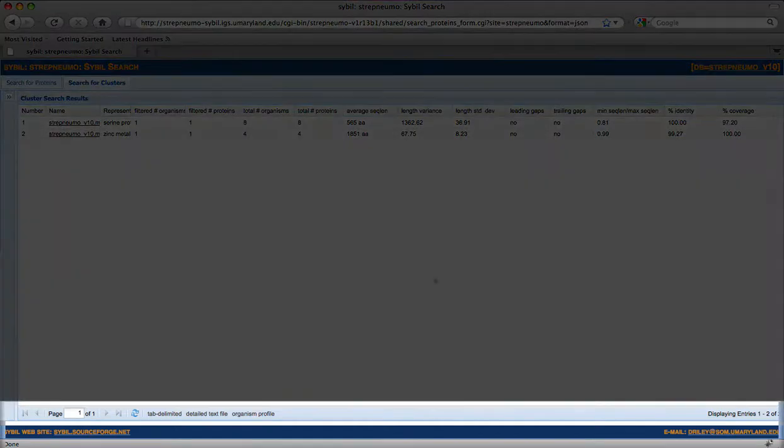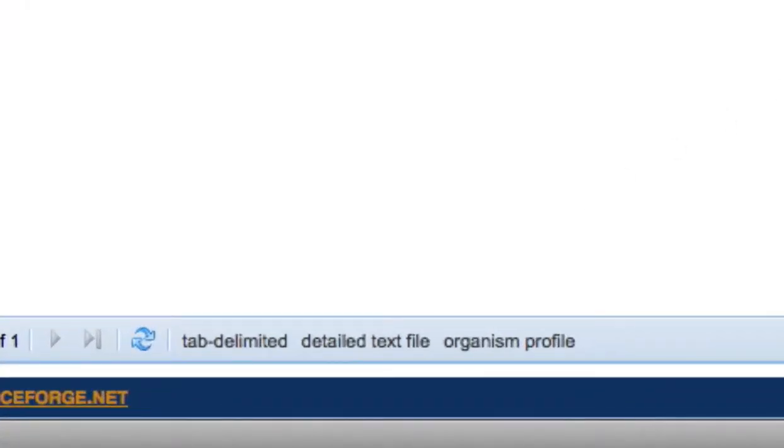The bottom of the output area houses the pagination controls on the far left, the record count and currently displayed records on the bottom right, and 3 download buttons. The first download button is the Tab Delimited button, and it downloads a tab delimited version of the list currently being displayed. The only difference is that all columns will be visible.